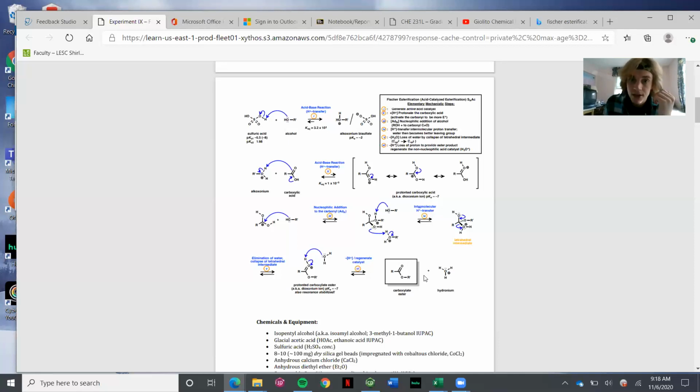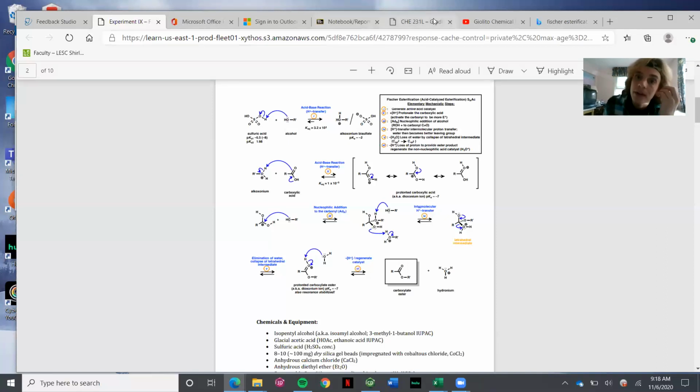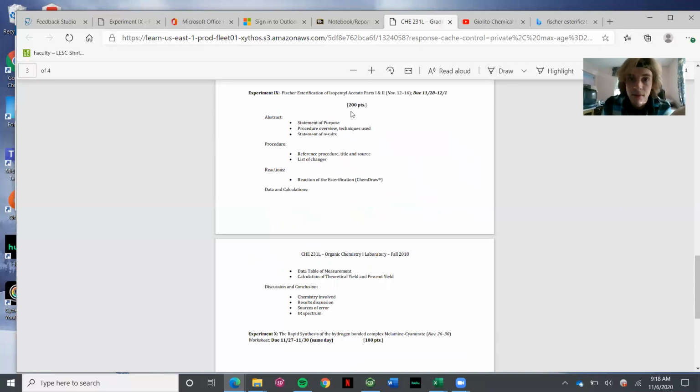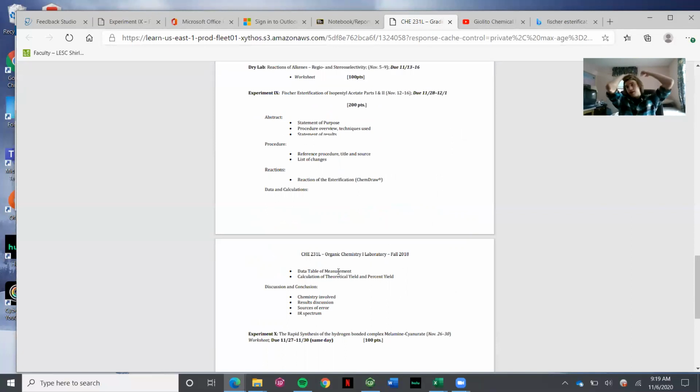So I want you guys to speak about the mechanism for me, okay? I'm going to need to see that in order for you guys to get full credit on this report. Right here, as I said before, 200 points. The chemistry involved. Now, data and calculations, etc. That's just going to be calculating your theoretical yield versus your actual yield, your experimental yield.